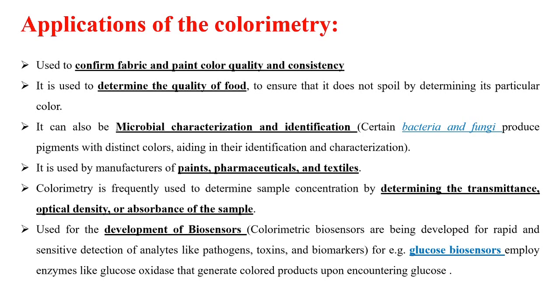But mostly in our lab, you guys will take the reading of the sample. We have one commercially available device that we will show you in the upcoming classes, and we have developed one device in our lab for analyzing the color of any sample. So we'll do it on the device that has been developed in our lab. It will give you the information in 4 color spaces.